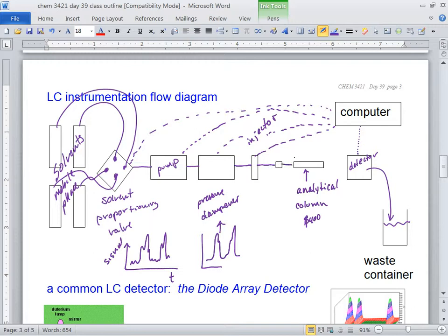So you buy a little dinky, tiny analytical column for a fraction of the price, like $40. And they call it a guard column, what Ricky mentioned. So that's before it. Not absolutely necessary. In fact, we don't even have one upstairs because we ran out of money. Not the $40. They want close to $1,000 for the little container that holds the $40 filter. So we don't have the 1,000. But okay. So now see how guard column, analytical column, no electrical connections.